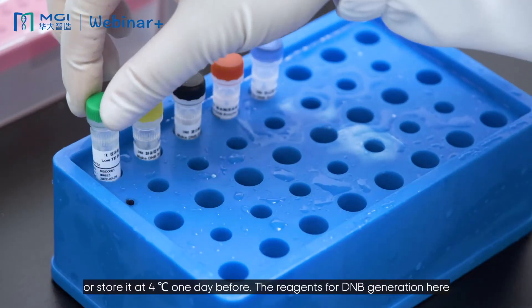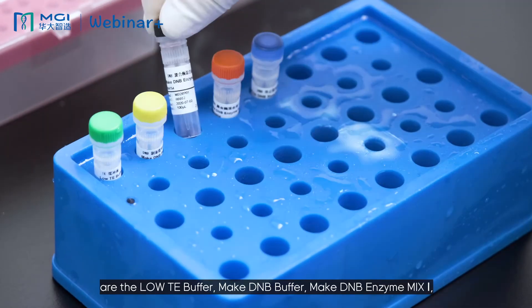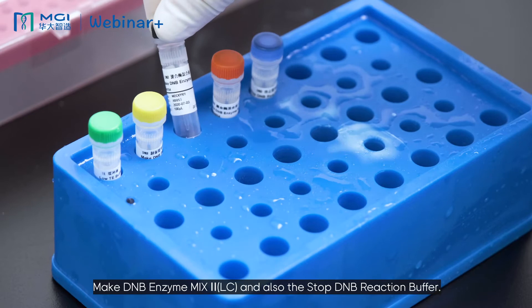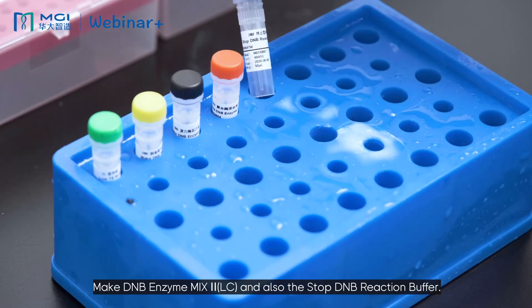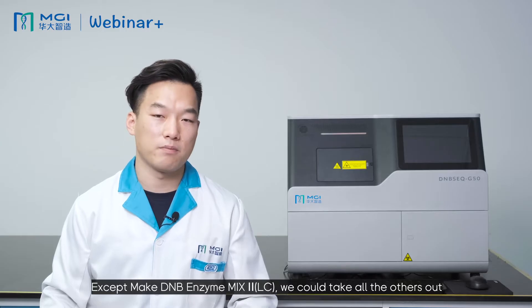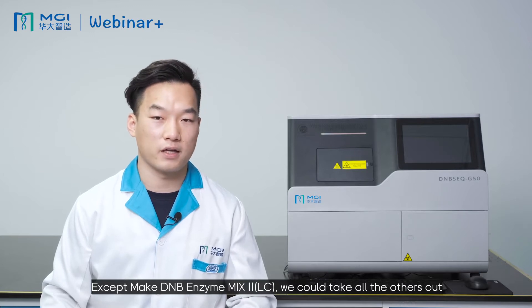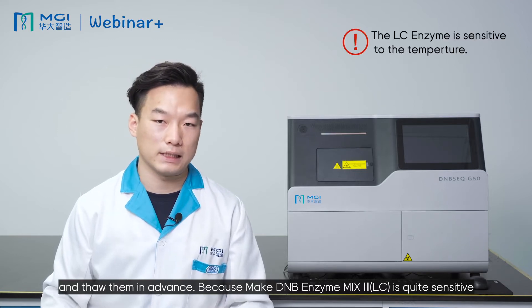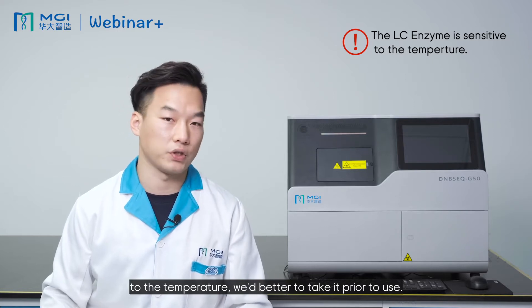The reagents for DNB generation include the low-TE buffer, MgI-DNB buffer, MgI-DNB enzyme mix, MgI-DNB enzyme mix 2-LC, and the stop-DNB reaction buffer. Except for MgI-DNB enzyme mix 2-LC, we can take all of the others out and thaw them in advance. Because MgI-DNB enzyme mix 2-LC is quite sensitive to temperature, we should take it out only prior to use.